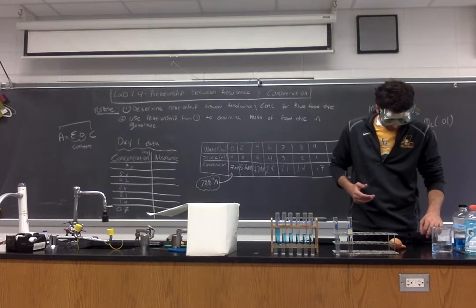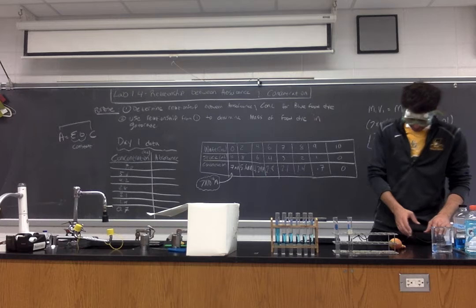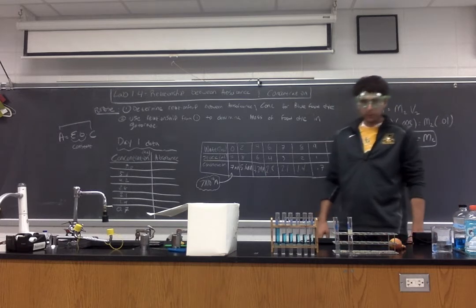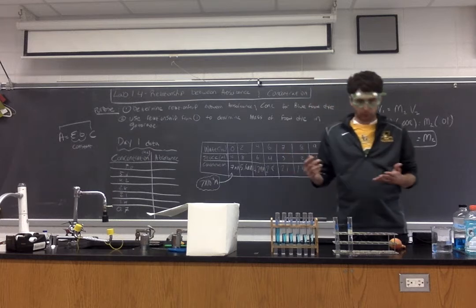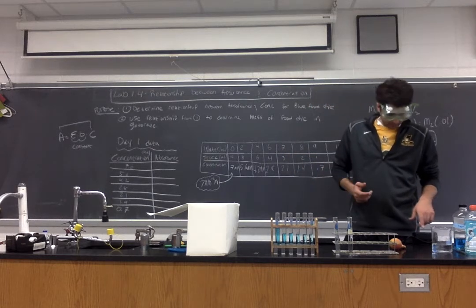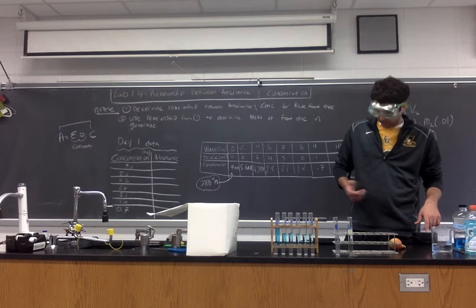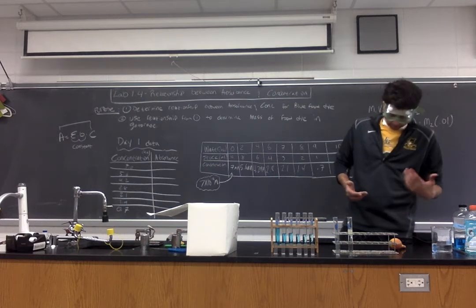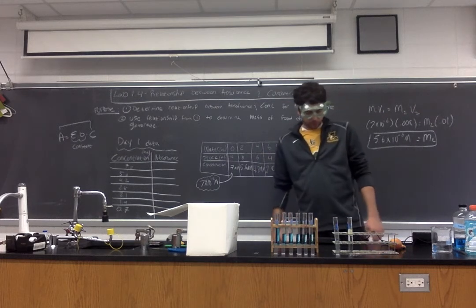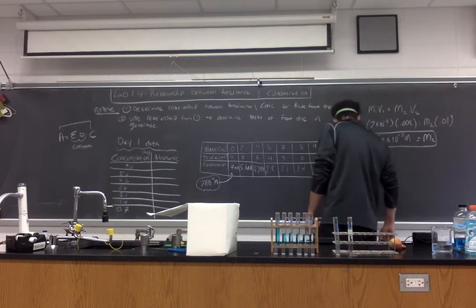So all I do here is I put the solution into the colorimeter. I close the colorimeter. And what we need to see right now with deionized water is an absorbance reading of 0. If it's not reading 0, you simply hit the calibrate button. Now, my deionized water is reading an absorbance of 0 right now, so I don't necessarily need to calibrate, but I'm going to anyway, just to make sure that we are on the same page.